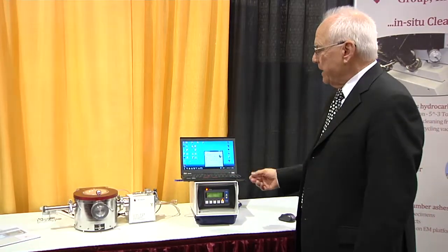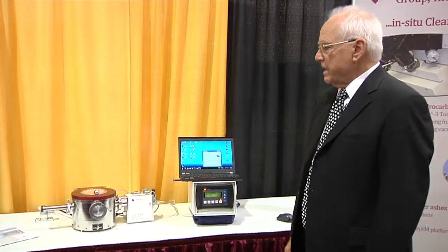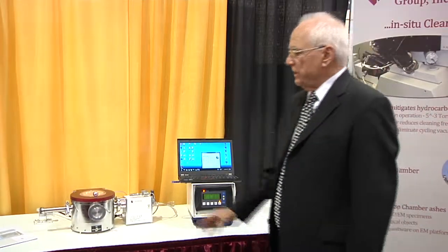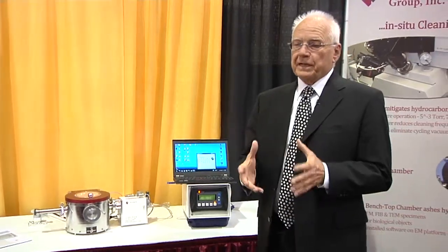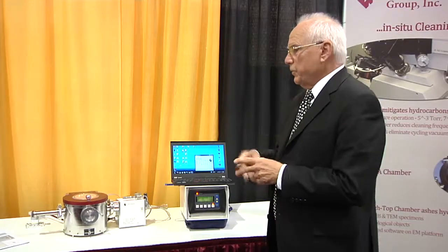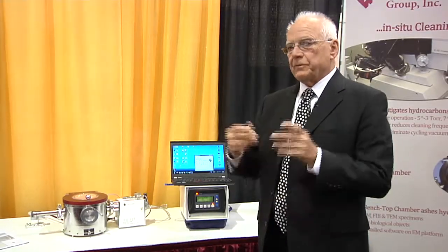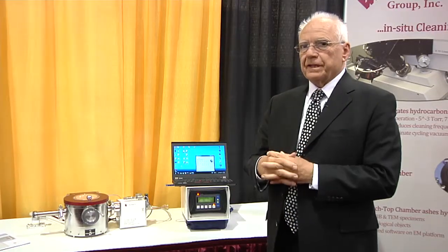I'd like to tell you about our in-situ plasma cleaner, which can also be turned into a benchtop plasma cleaner. Actually, it's not a real plasma cleaner — it's a downstream plasma cleaner. There's a technical difference between that, and we can tell you all about that in detail with our brochures and our information.